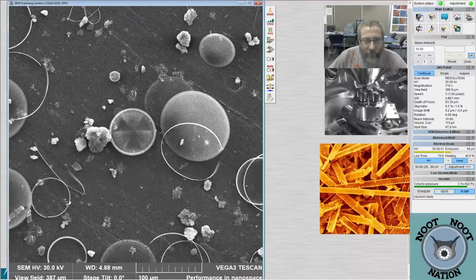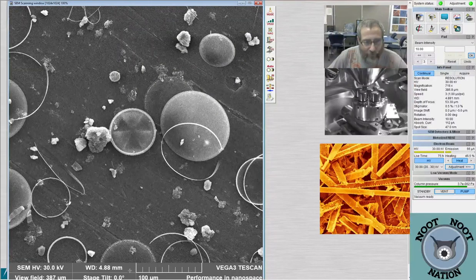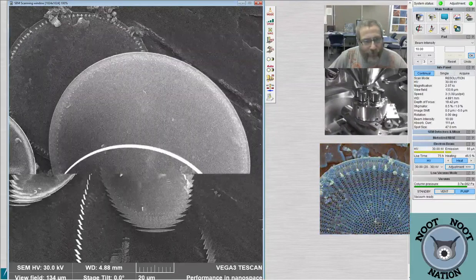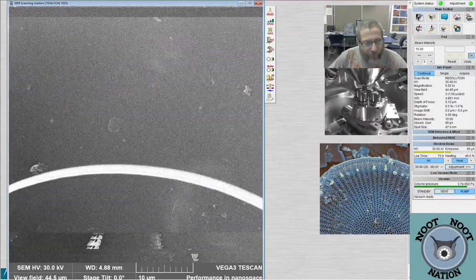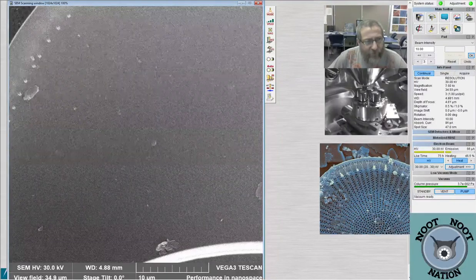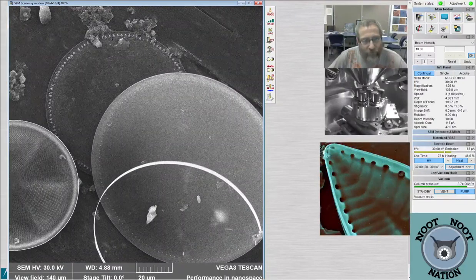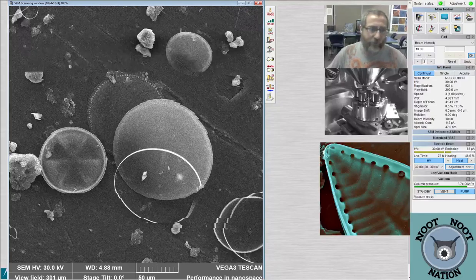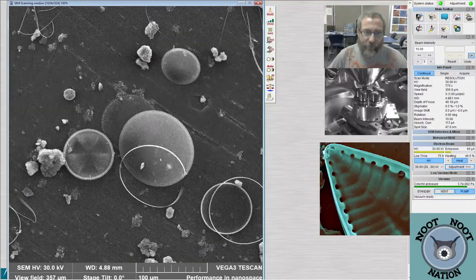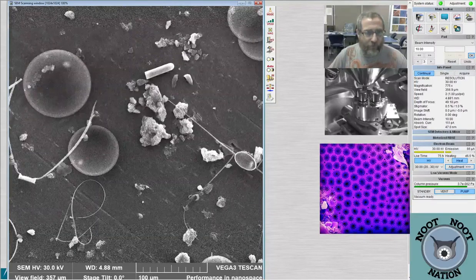But you can see this is a different diatom here. It doesn't have the lumps. But that one and that one are the same. And I'm not sure if this is an internal view or an external view. Oh, this is an internal view. So it could be the same as this one, just inside and outside together. It's a possibility. This is also the Thalassiosira. You can see the rimoportula stem, the piece coming up off of it.